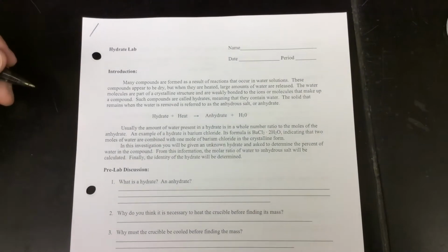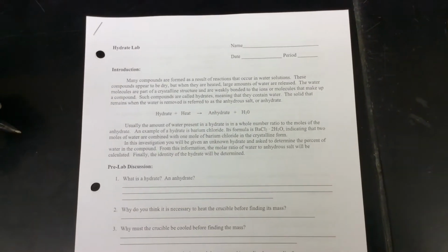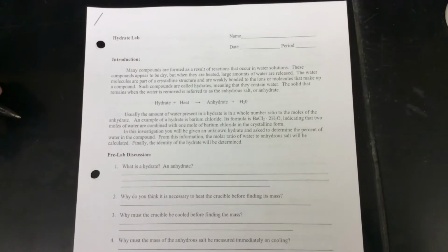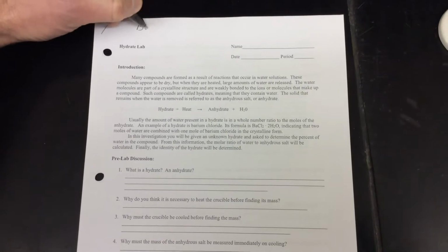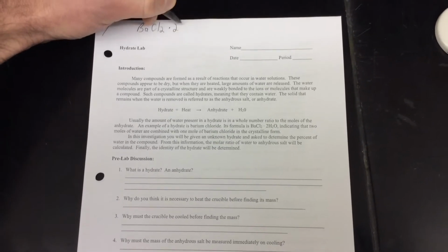In this video, I'm going to go over the Hydrate Lab. A hydrate is an ionic compound that has water molecules loosely stuck to it. So in this case, we're going to work with barium chloride dihydrate.